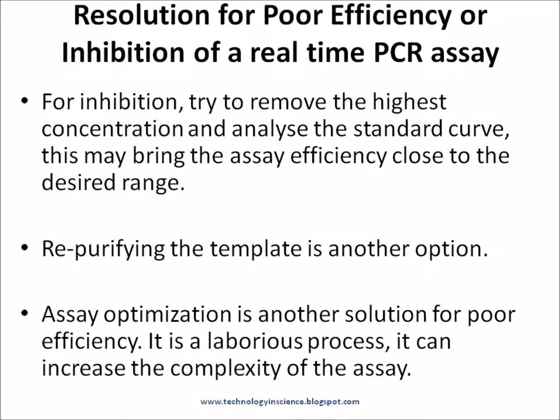Once it is found that the assay is not performing at close to 100% efficiency, or inhibition is occurring, steps should be taken to bring the efficiency to an accepted range. For inhibition, try removing the highest concentration DNA dilution and analyzing the standard curve. This may bring the assay efficiency close to the desired range, because the highest template concentration also carries the highest amount of inhibitors — when diluted, inhibitors are reduced to a level that is no longer inhibitory.